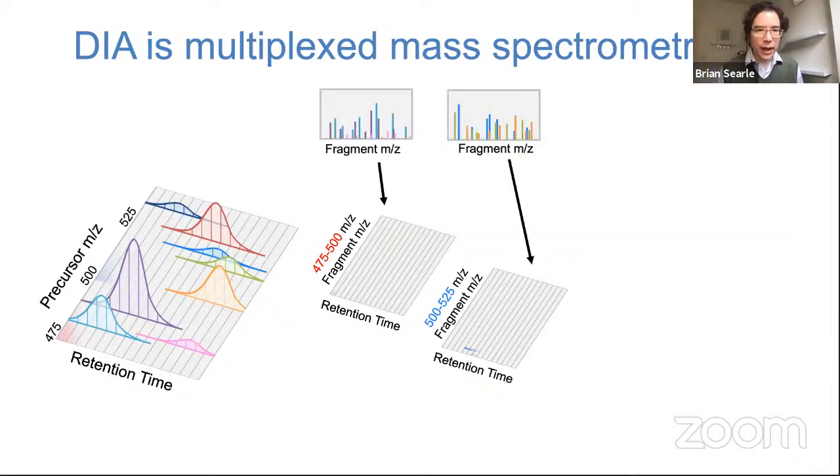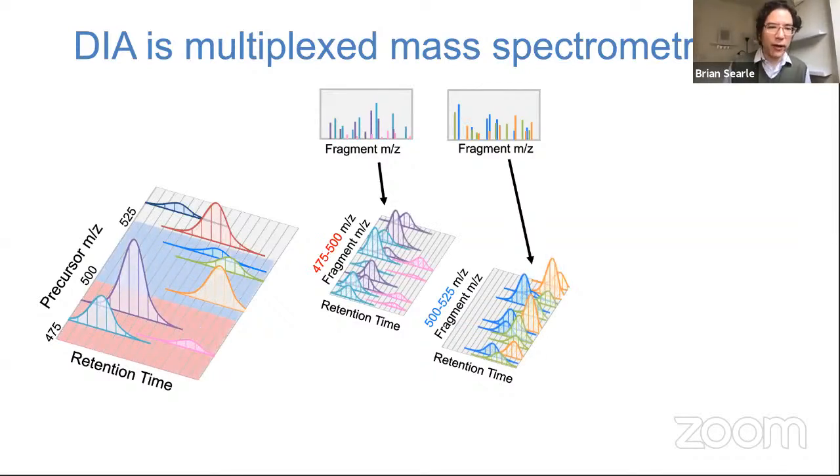Okay. And so what's going on here is that we are actively co-fragmenting multiple peptides at the same time that come within the same wide window in this particular case. So the MS2s that we're collecting, the individual mass measurements, are extremely complicated. They come from oftentimes 20 to 100 to even a couple hundred different peptides at the same time in the same scan, in the same MS2. But one advantage here is that we get time dimension information. So we can monitor these fragment ions over time as they rise and fall.